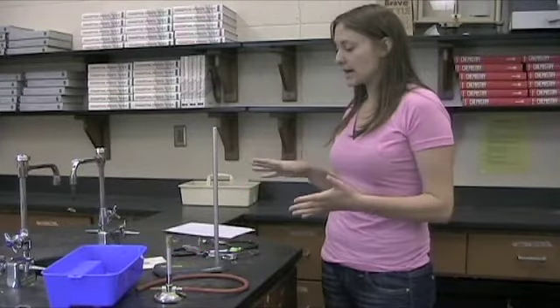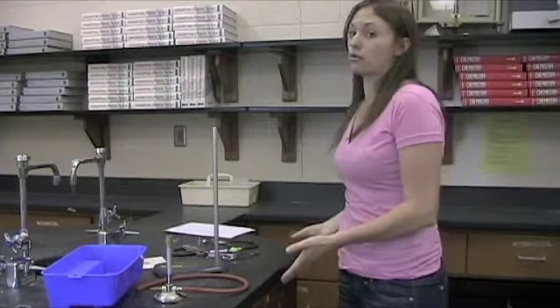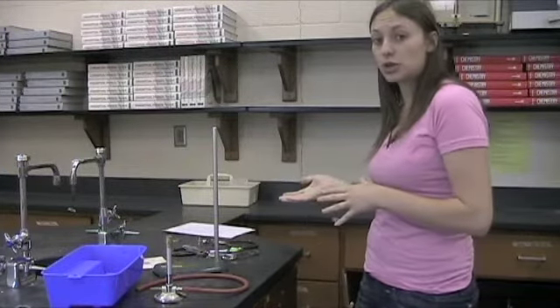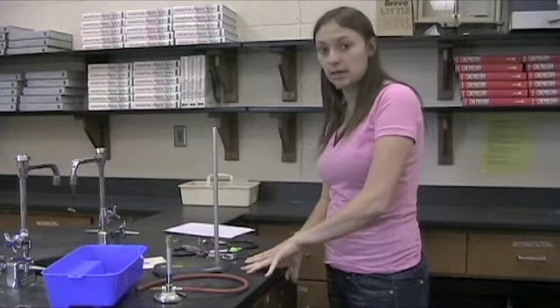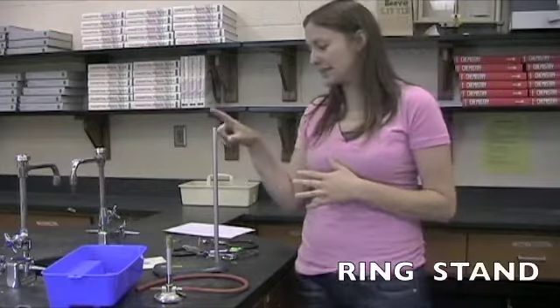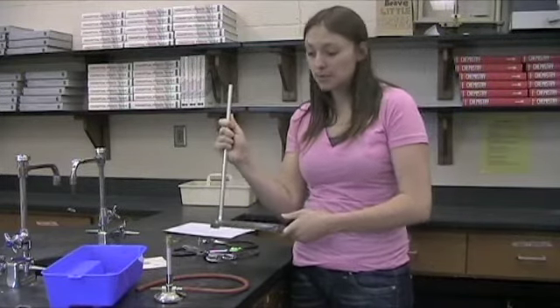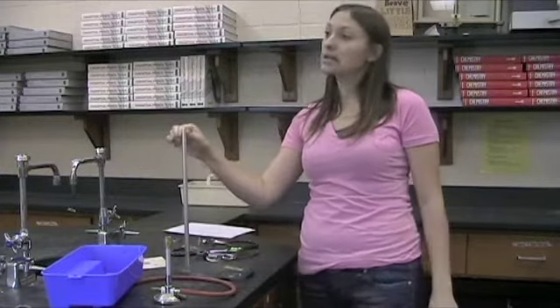All right, now we're going to talk about all these items that are in your side cupboard. So your drawer is your drawer. That's you and your partner and that's it. No other class period. The side cupboard you will share with anyone in another period who uses this lab table. So here we go. You have a ring stand. You use this for many different kinds of setups. Usually with a Bunsen burner. You can put any type of clamps on here and get different things at different heights.